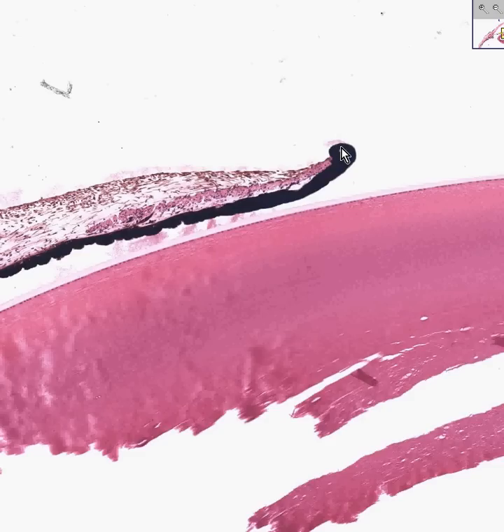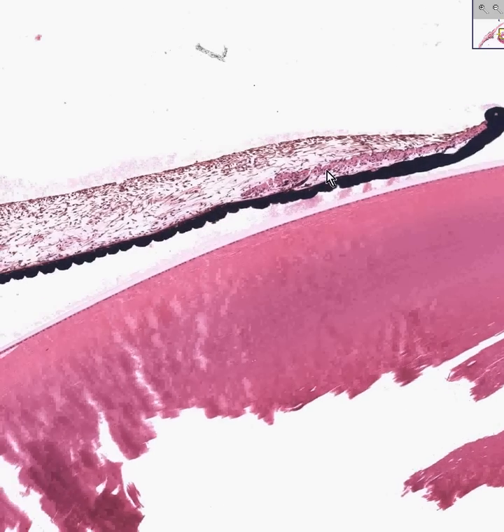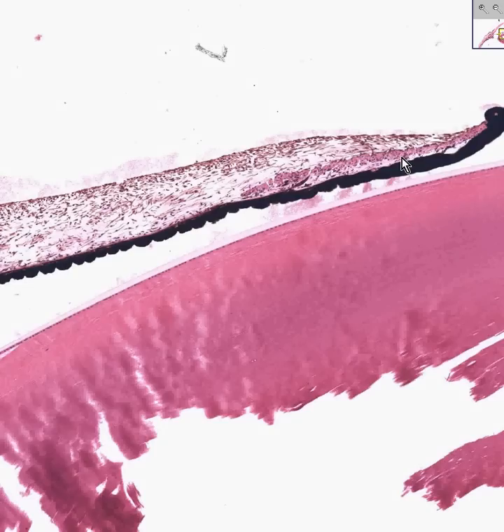These smooth muscle fibers near the distal portion of the iris are constrictors under parasympathetic control. And if you look closely, and we will, we'll look a little more closely, you could see they're smooth muscle. And yes, they are.